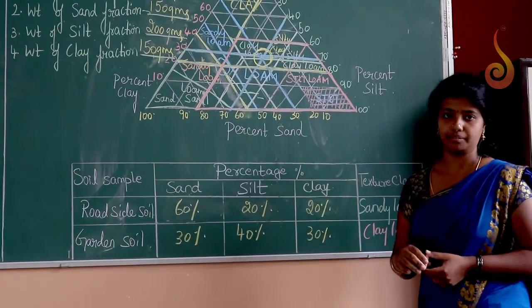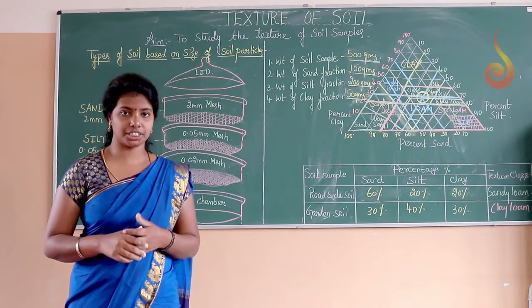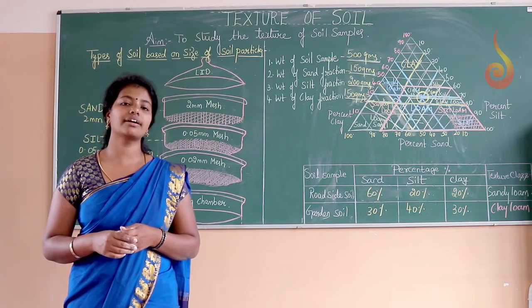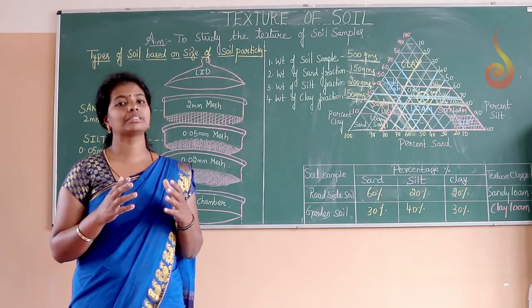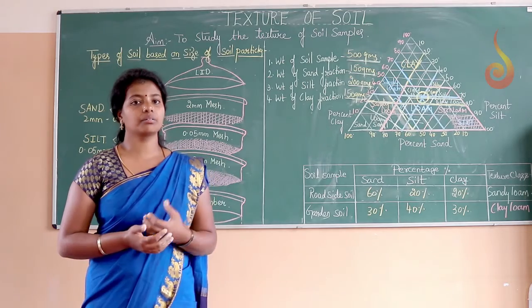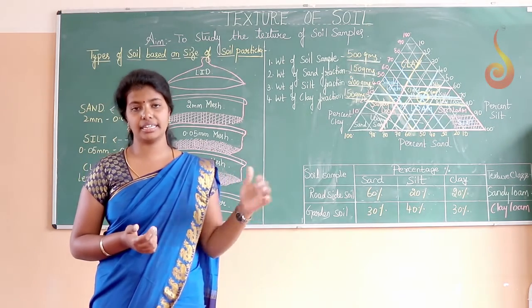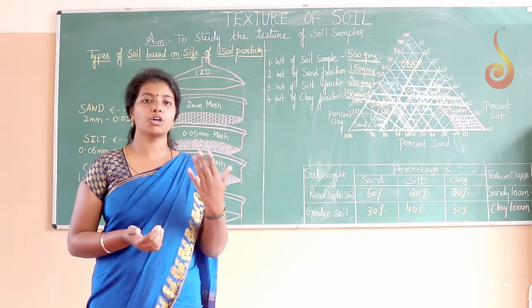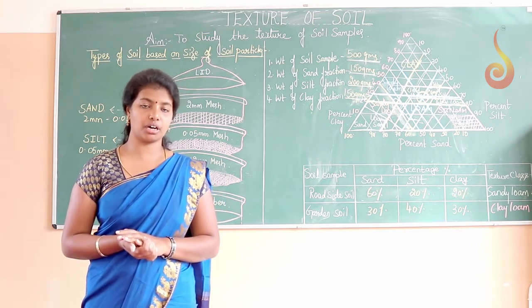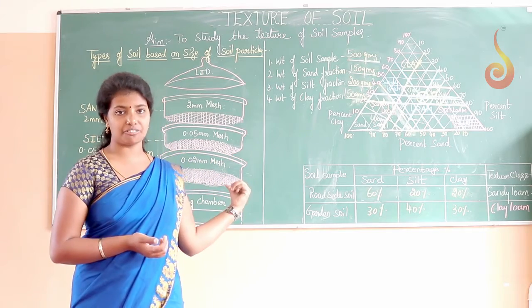clay loam soil. So this experiment is actually a demonstration experiment and this is not there for the exam. It is just to study it, and hence it is not done practically in the lab, but the method is taught to you, and I hope that you all have understood how the texture of the soil is determined by the sieve method.